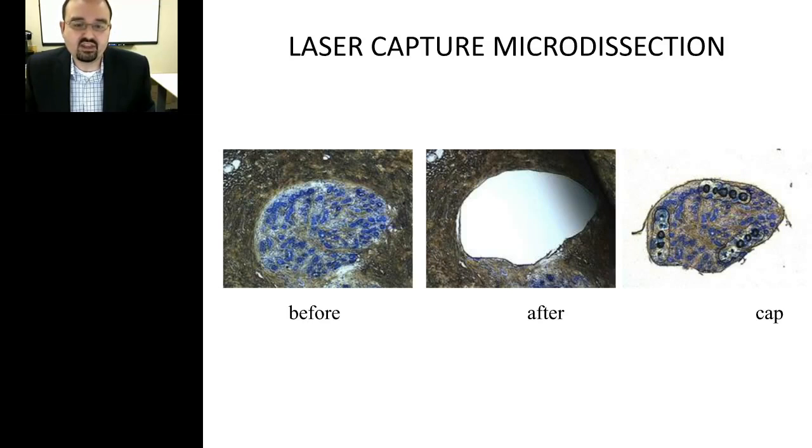And the question we ask ourselves, as scientists, is where can we look to better define this disease and define new therapeutic targets? To do this, we embarked on a comprehensive RNA sequencing study where we took 20 microdissected normal breast tissues from healthy volunteers from our Susan G. Komen for the Cure tissue bank at the IU Simon Cancer Center. In addition, we sequenced 10 triple-negative breast cancer tissue samples from our institution.